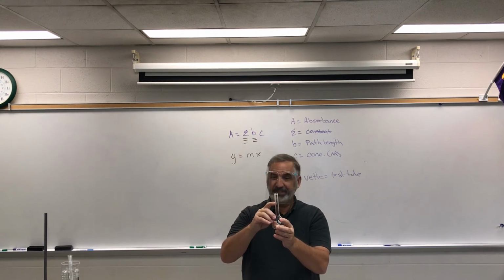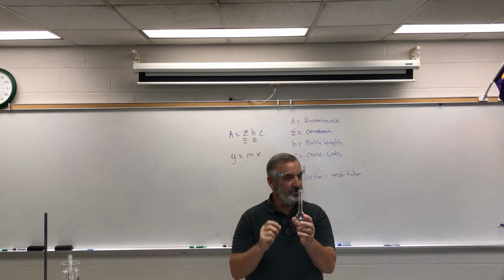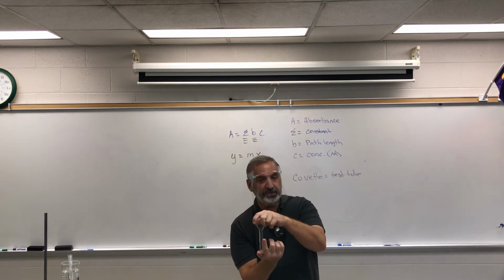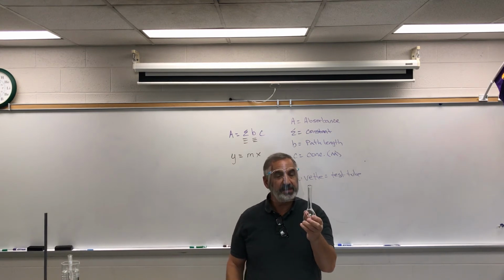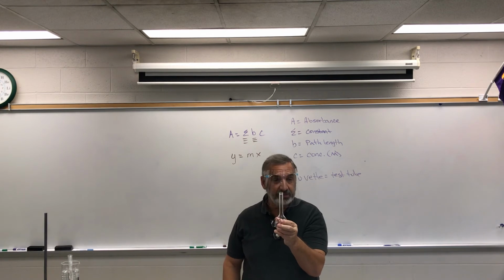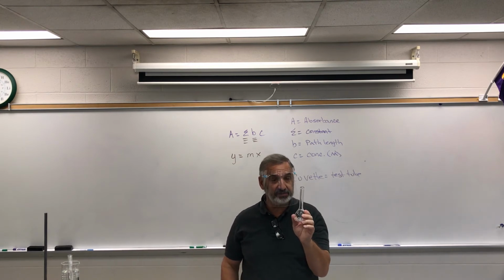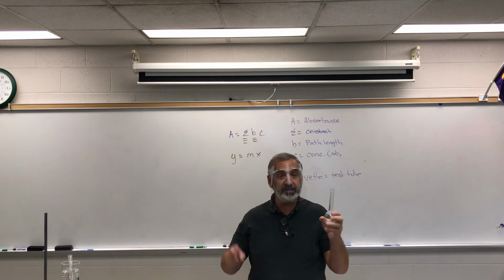Okay, so we can just add little by little, drop by drop, once we're getting close, with the wash bottle. Then once you have that, put the cap on it, turn it upside down a couple of times just to get the rest of that all mixed thoroughly. So now we're going to measure the exact grams, so we know moles, we know the exact volume, so we know liters, so we know the exact concentration of our solution. So our 0.1 molar solution is going to be what we call our stock solution.